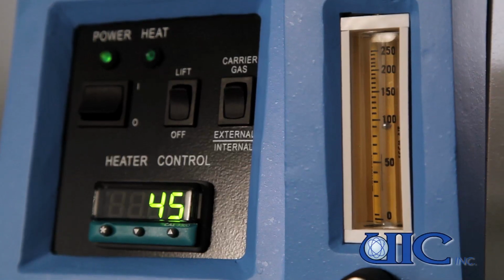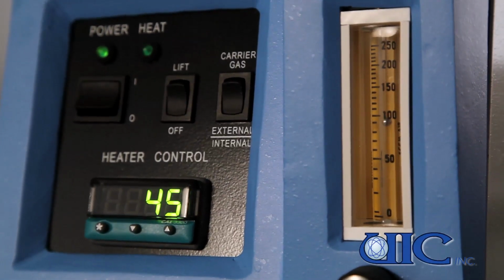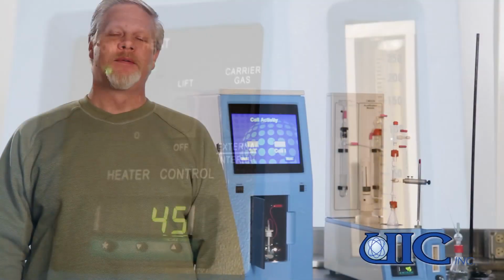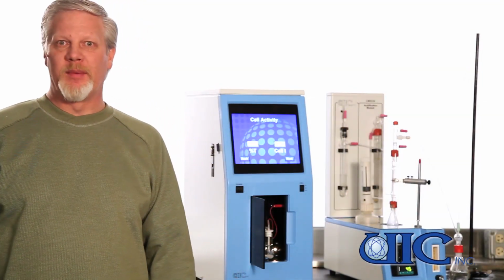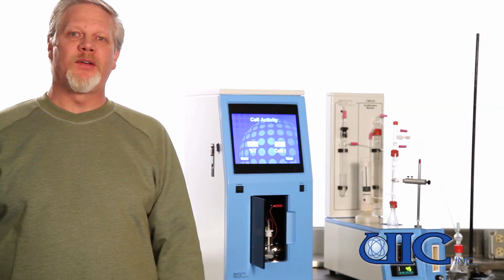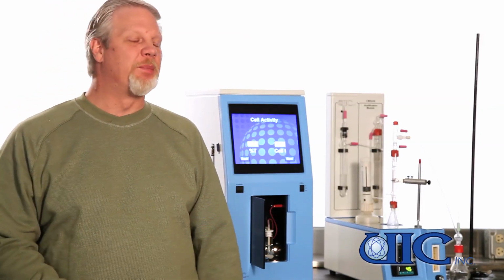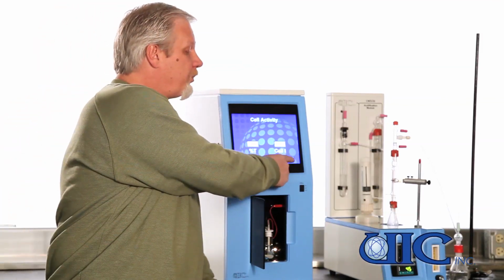For most analyses, 100 milliliter per minute flow rate is appropriate. So we've set our flow meter for that. Now that we've let the cell equilibrate for 30 minutes, we can start with our blank analyses, our standard analyses, and then our sample analyses. First thing we'll do is a blank analysis. We'll press the next button on the screen.